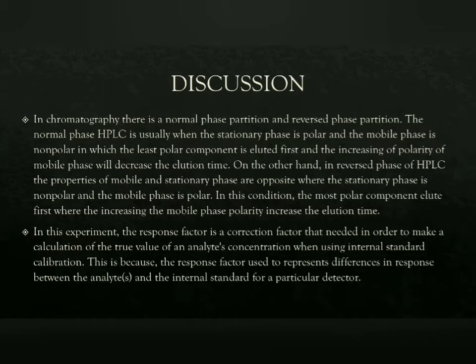In this experiment, the response factor is a correction factor that is needed in order to calculate the true value of the analyzed concentration by using internal standard calibration. This is because the response factor is used to represent the differences in response between the analyte and the internal standard for a particular detector.